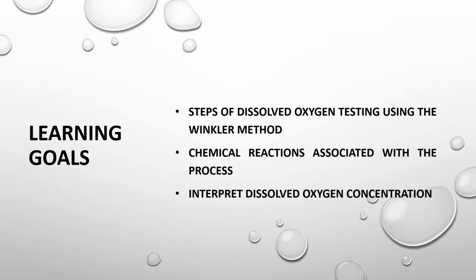The learning goals for this video are to understand the steps of the Winkler method, become familiar with the chemical reactions associated with the process, and be able to interpret if the measurement is indicative of a healthy water system.